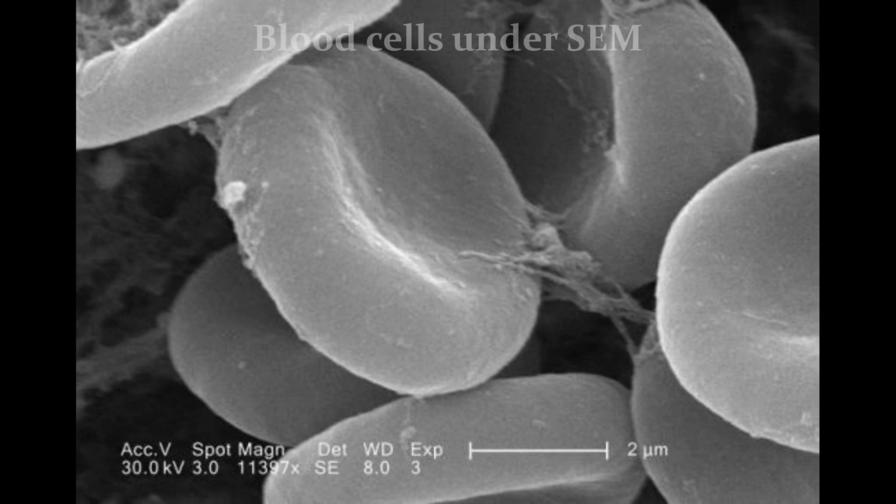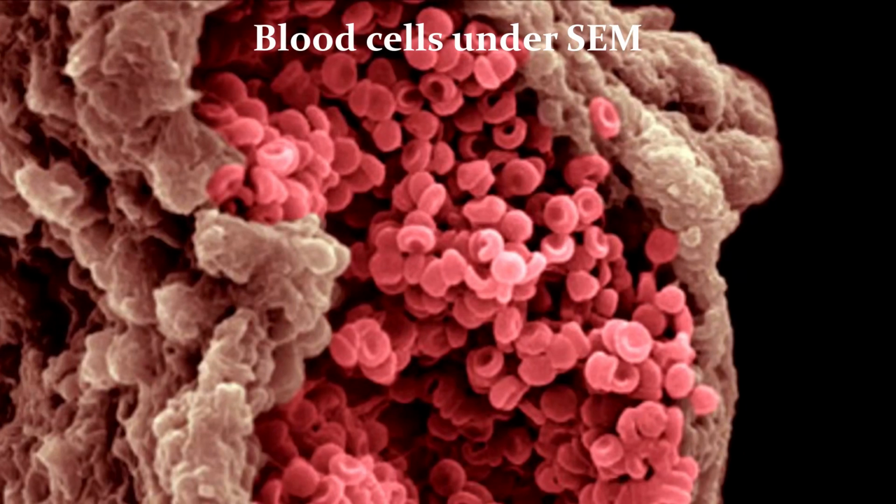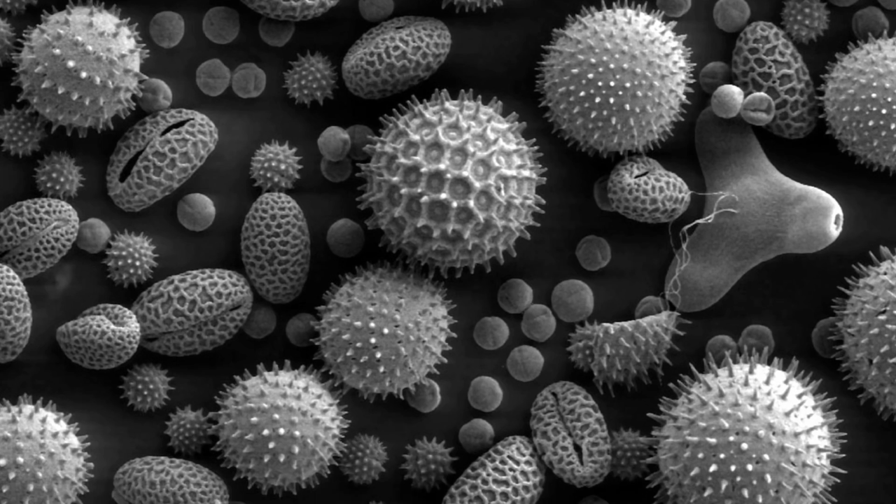It doesn't give us light, because we're building the image just in black and white and grayscale rather than true color, because color is light. And the electrons which we detect, they don't record as light. But you can color your images later using modern programs.